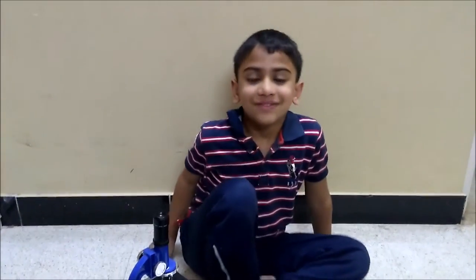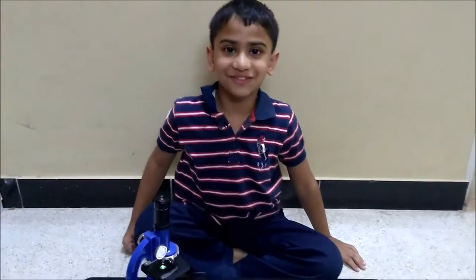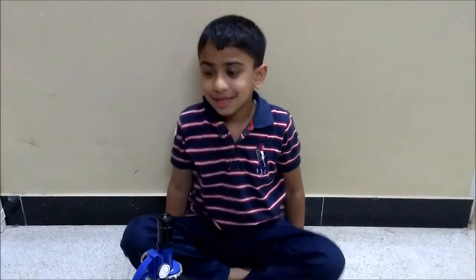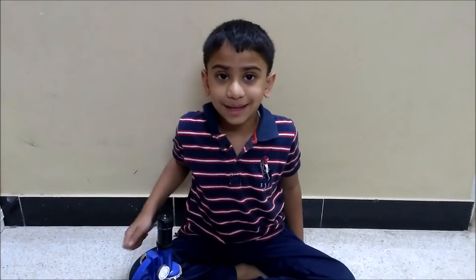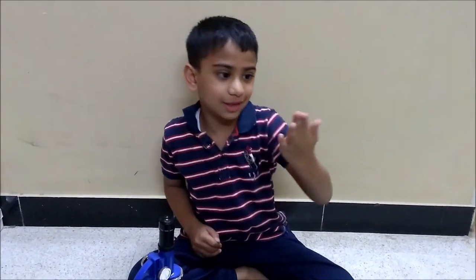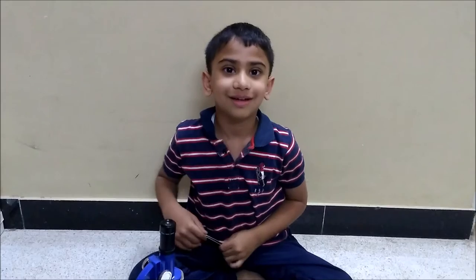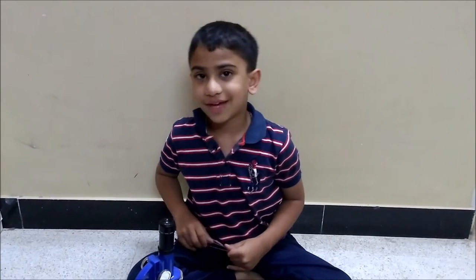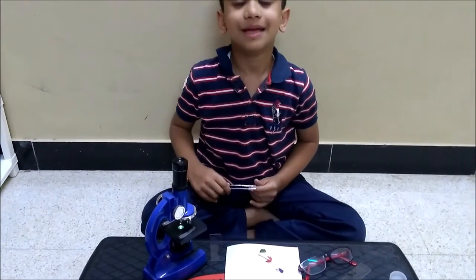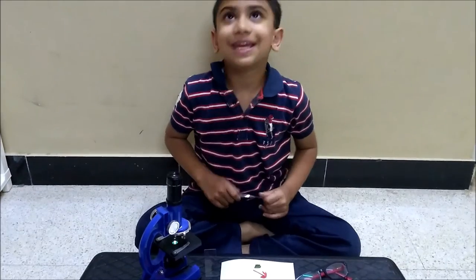Welcome back to Bully Plane Movies. I know it's been a long time since I've been making videos, but my mother had so much work she couldn't conduct the video, and then I fell ill. But today we have something very interesting for you — it is microscope.